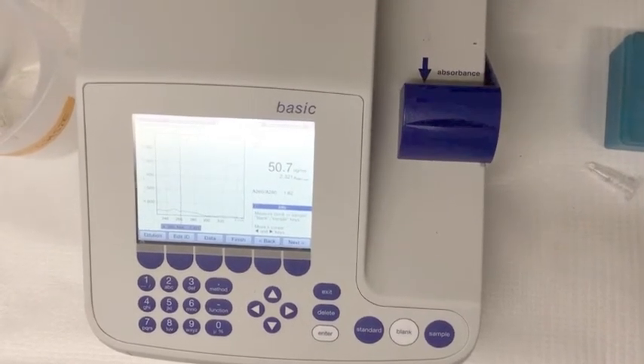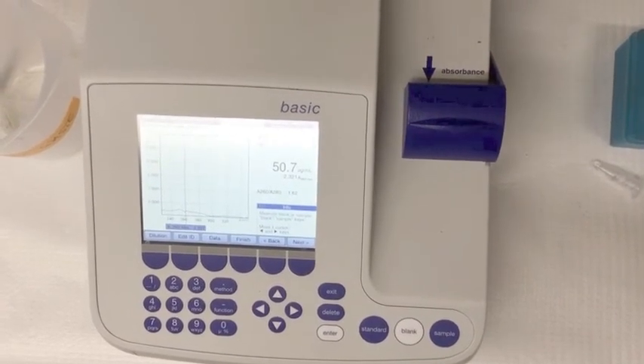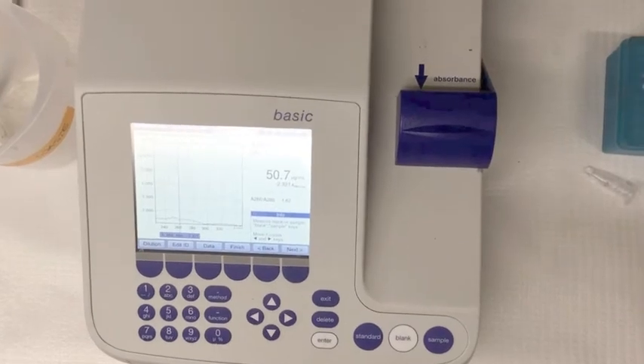Now record the data that comes up on your machine. The best way to do this is to take a picture and refer to it later. If an error appears, try again.